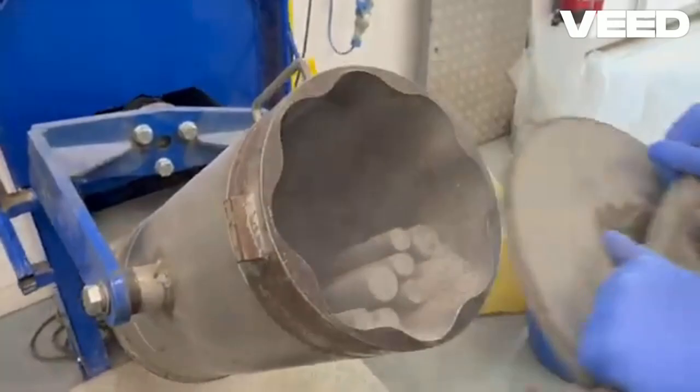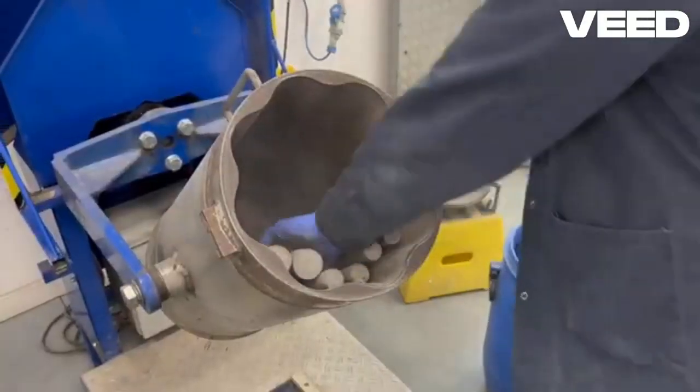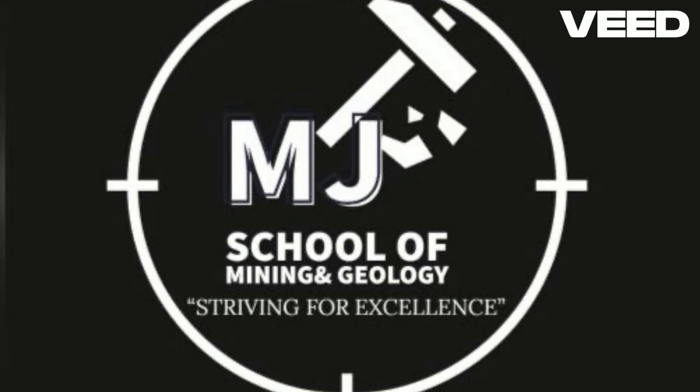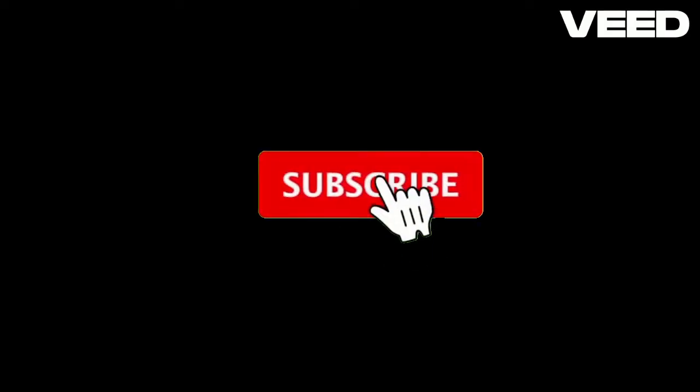In conclusion, the comminution process serves as the cornerstone of sample preparation in geology, unlocking the hidden secrets of Earth's composition with each finely crushed particle. Through the relentless action of crushers, mills, and pulverizers, solid materials are transformed from rugged chunks into meticulously sized fragments, ready for analysis and interpretation.